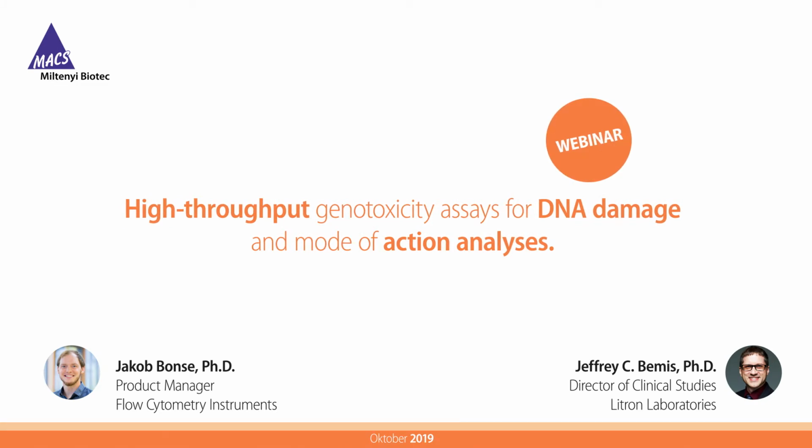Hello. I welcome everybody to today's webinar about high-throughput genotoxicity assays for DNA damage and mode of action analysis. We will discuss how you can modernize your genotoxicity testing and in which points you can improve your test performance in the most beneficial way.